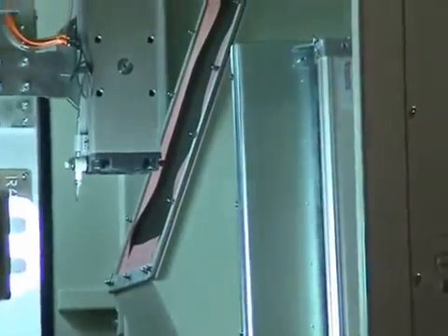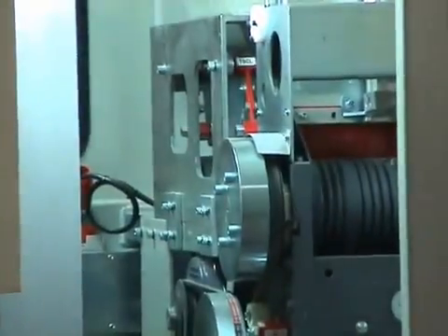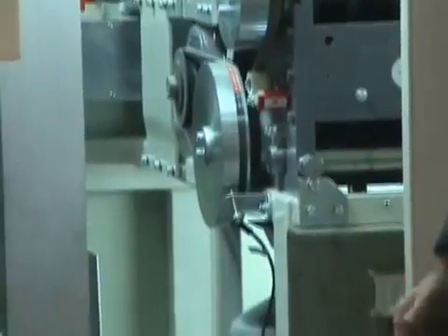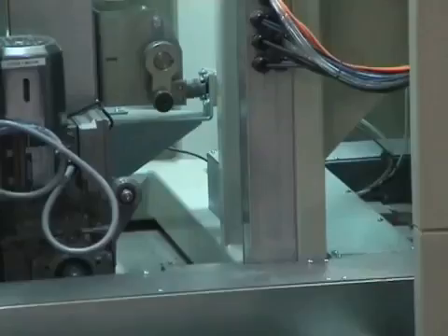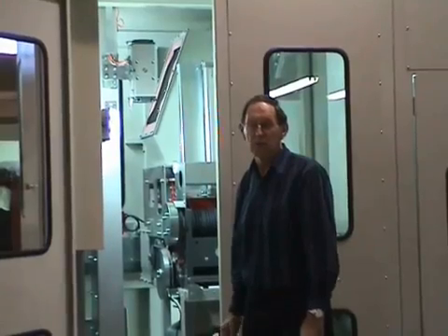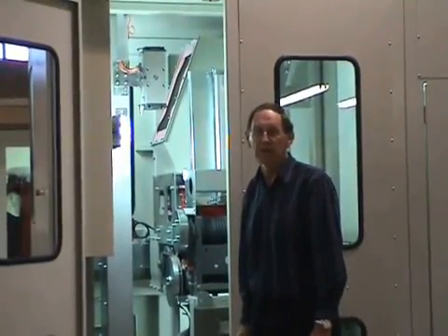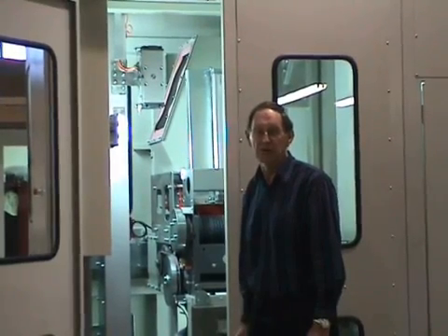This is the sample lifter — it lifts the bin, rotates, and drops it into the hopper. The sample then travels to the boy crusher along a mechanical feeder which includes a screen, which we call a self-cleaning screen, developed by Rock Labs. The screen removes fine particles which don't need crushing any further, and the coarser material passes over the screen and into the boy crusher.